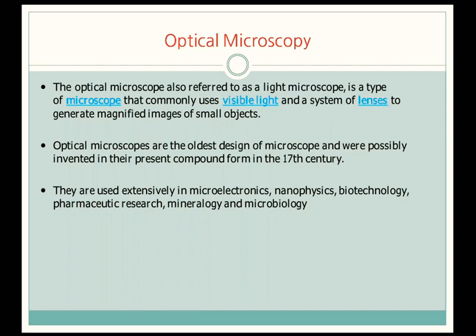Optical microscopes are the oldest design of microscope and were possibly invented in their present compound form in the 17th century. From the 17th century onwards, the evolution of the microscope started, and many inventions have taken place in the field of microscopy. The microscopes of the present generation are of very high power and highly magnified.